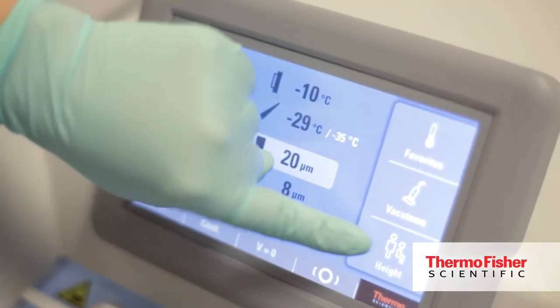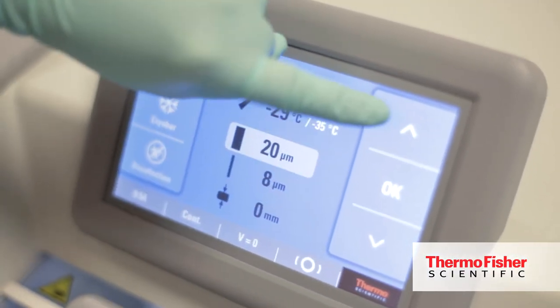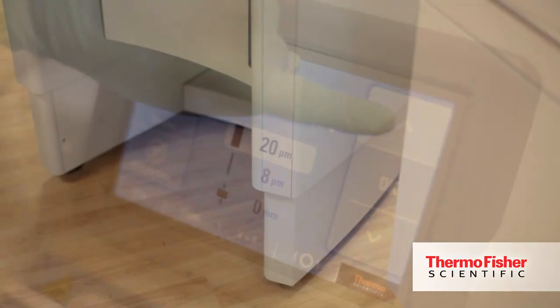We understand that some customers will be at this cryostat for a number of hours a day. With that in mind we want to make their experience as comfortable as possible. We've integrated an optional height adjustment feature allowing them to cryo section either from a sitting or standing position. This also addresses the situation when you have multiple users in the lab space at varying heights — they could easily at the touch of a button adjust the cryostat to the most comfortable setting possible.